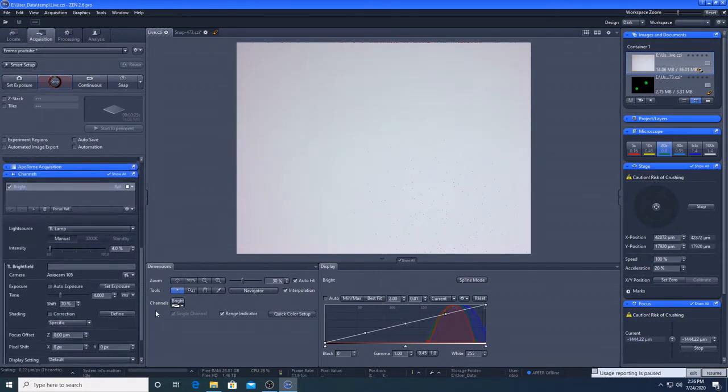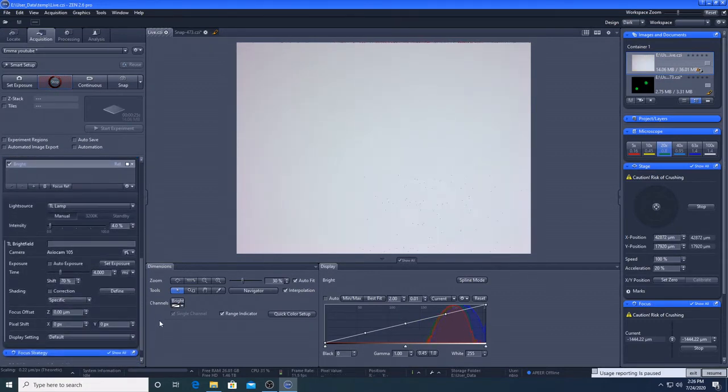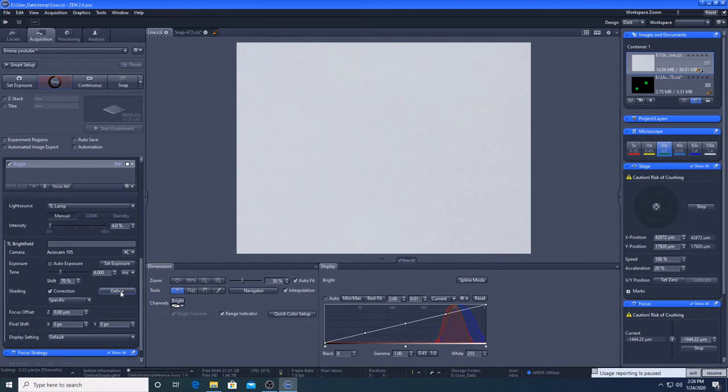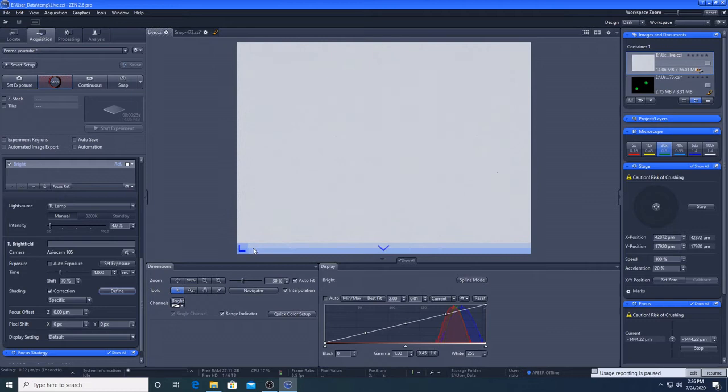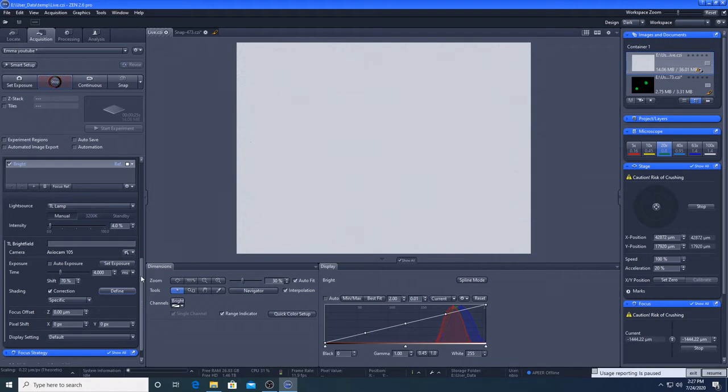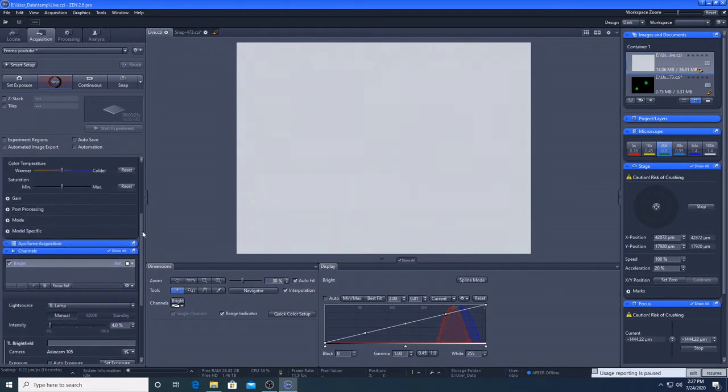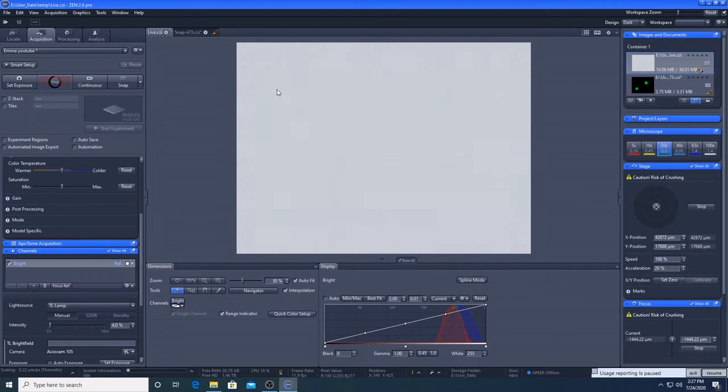And we can also do a shading correction. So we will put on flat, and we will define it. And that just gives us a flatter image. So before that was maybe slightly darker at the edges. And that's to do with the shape of the lens. And so now when we go back to our sample, hopefully it will be easy enough to find it.